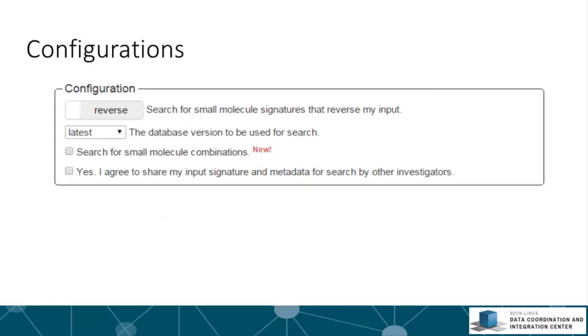In the configuration section, the mimic-reverse slider allows you to choose between either a search for small molecules that would mimic the input signature or ones that would reverse the input signature. The default search mode is reverse.